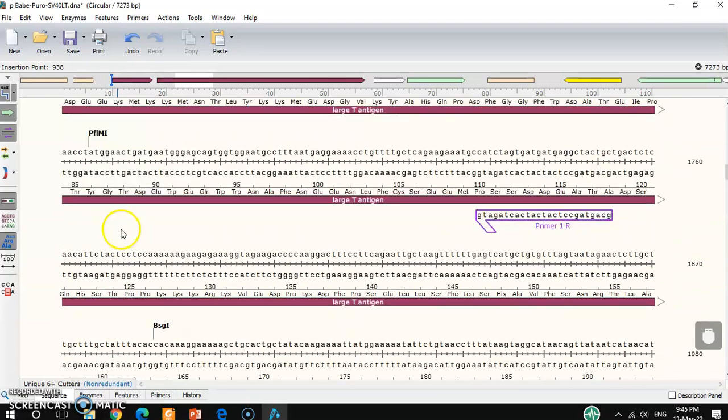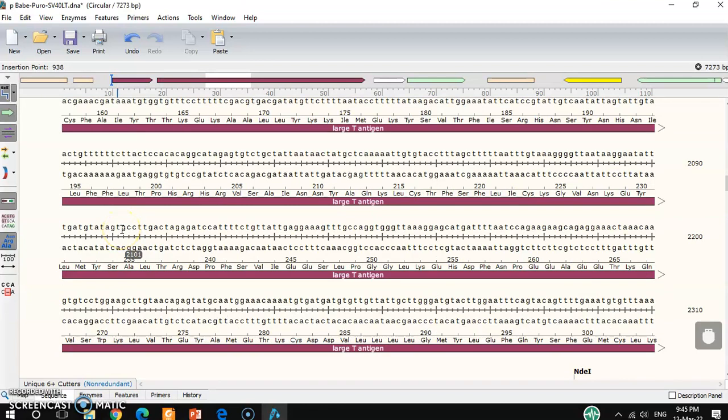And also you can select a primer. You can also make primers using SnapGene. For example, this is this part. If you want to create a primer here, let's assume it starts from the GC part. GC is actually the strong part.